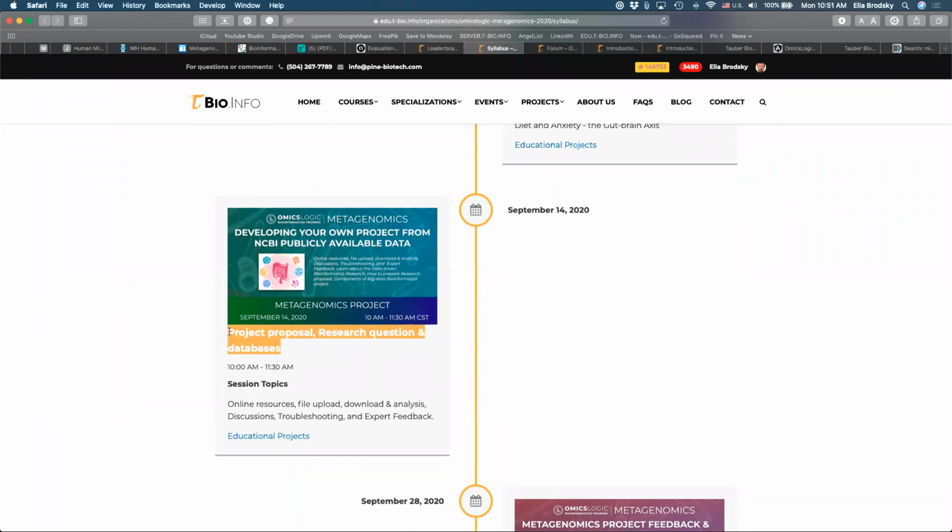It will take us some time, but we will review types of sequencing, types of data, types of analysis pipelines, what are some example projects, and then we will start looking for those projects and also think, how do you actually plan for and structure your analysis so that the project that you have developed could both be completed in a short period of time, you understand the significance and can communicate the significance of this project to other participants of this program.